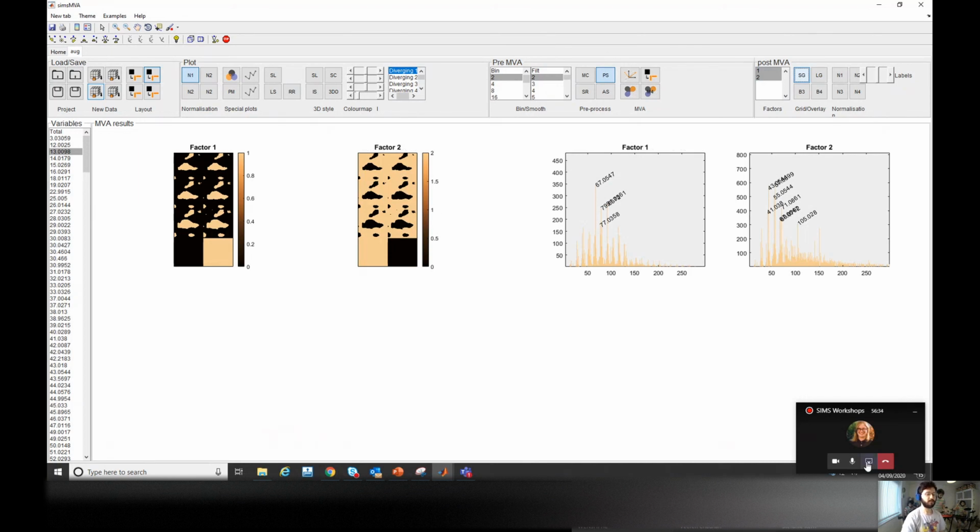Okay, so as I said before, my hope was to inspire you to apply these methodologies to your data sets if you have references or samples which are very complex. So you may consider buying references and measuring maps to help your MVA analysis, or even combining things in your depth profiles to see how things change using the same methodology. Yeah, that's all I had. Thank you.